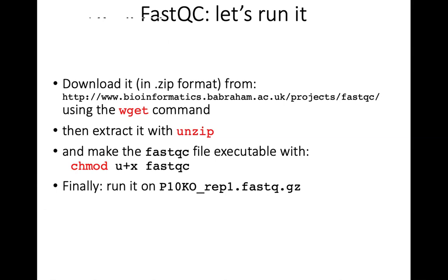Okay, it's trying to open... -h. Try the same thing. Oh, no, sorry. Just reuse the previous command. Control C to remove these characters. Just up arrow, the actual arrow key, right up. Yeah, and -h, like help. Just dash, and the h is for help. Okay, enter. And then you have the help for FastQC.